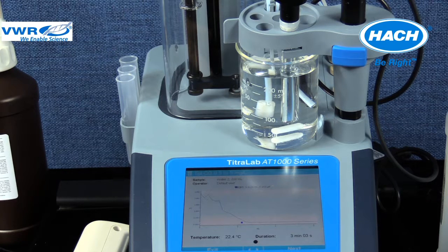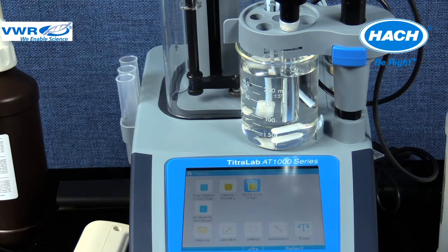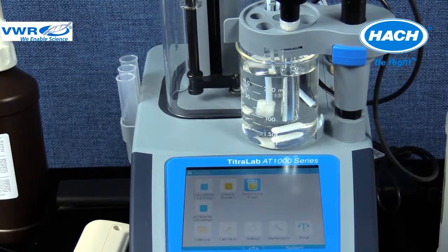By using the arrow keys on the keypad, the second screen can be displayed. In this application, the second screen displays the final curve, highlighted endpoint, titrant volume, and current measured when the endpoint was achieved. If measuring more samples, then the next button can be selected. If there are no other samples to be measured at this time or using this application, then exit can be selected. Once exit is selected, the software will display that the analysis results were saved and will return to the home screen.